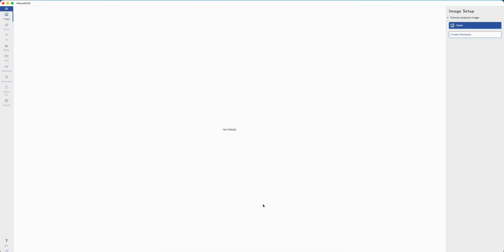So if you are currently using a Bio-Rad ChemiDoc or another scanning piece of equipment from Bio-Rad, you'll know that they export typically in a .scn file format, which was somewhat proprietary to ImageLab, meaning you were kind of stuck using ImageLab if you wanted to use your raw export and not convert your files.